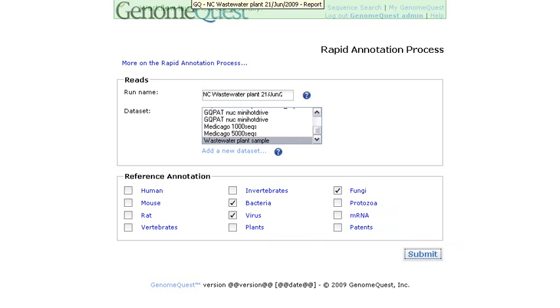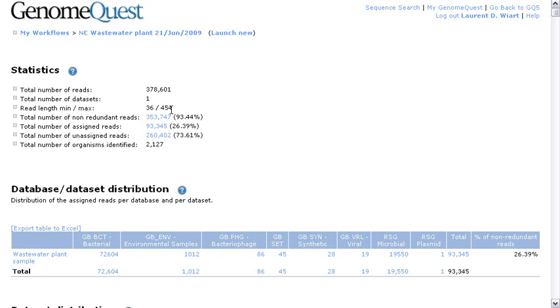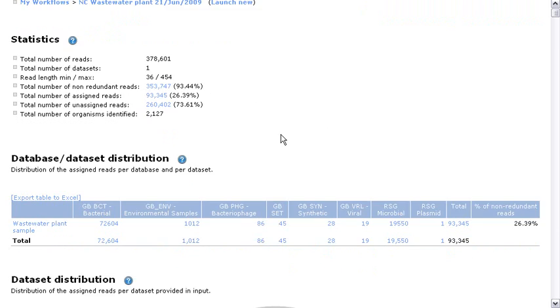Right now, the workflow is launched and after a few hours, this is the report you get from this experiment with a statistics part telling you how many reads were analyzed, what is the length of the reads, the extremes, the number of non-redundant reads assigned and non-assigned.